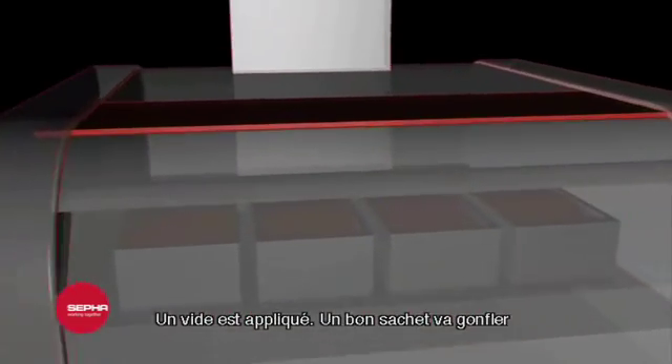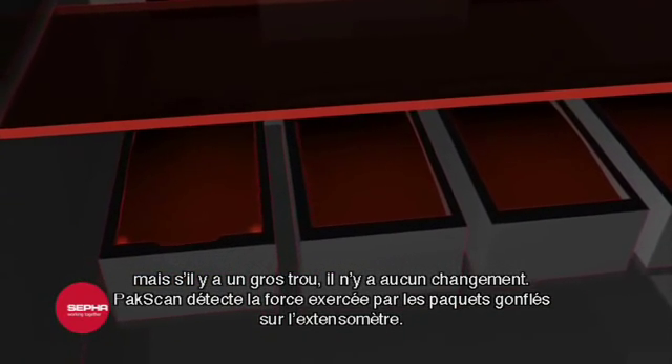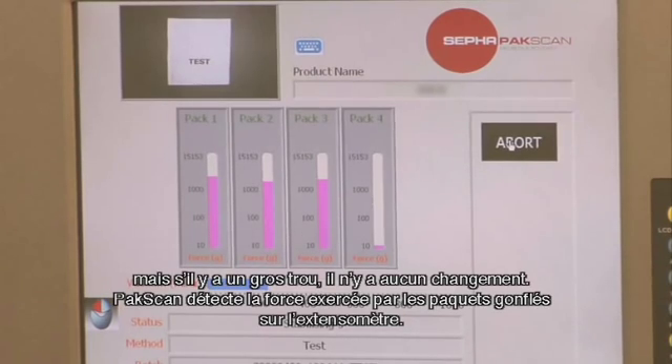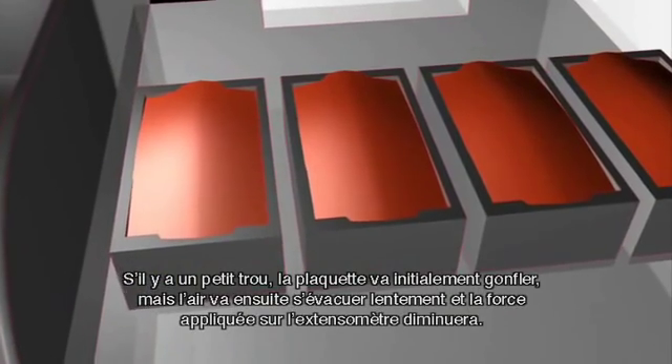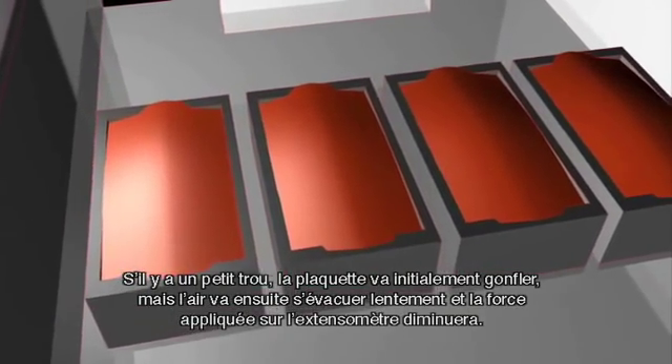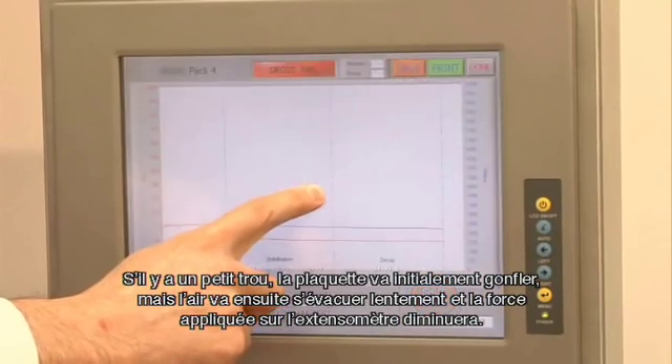A good sachet will inflate, but if there is a large hole there will be no change. PackScan detects the force exerted by the inflated packs on the strain gauge. If there is a small hole, the pack will initially inflate but then the air will leak out slowly and the force on the strain gauge will decrease.